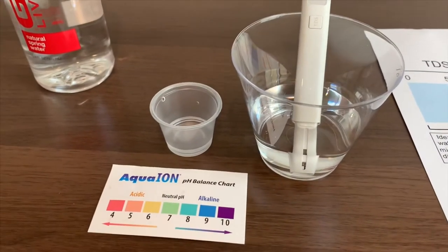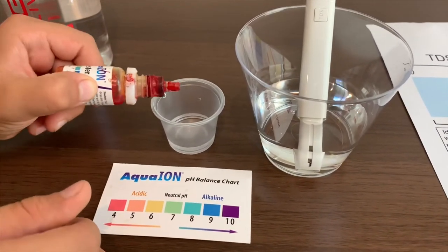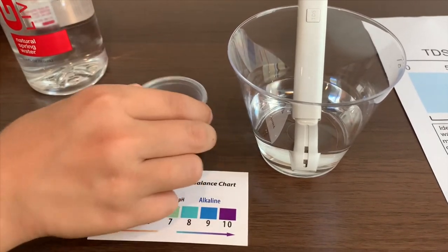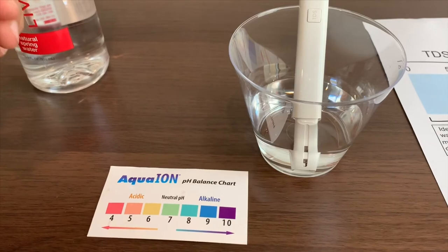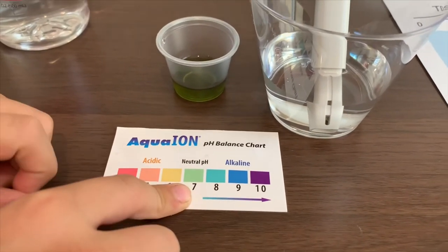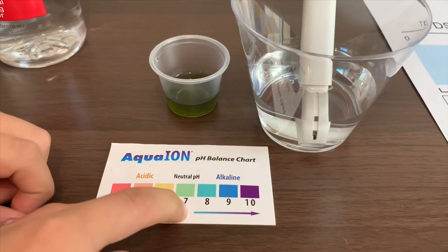Now let's test the pH. Only do two drops. It is green, so it is a 7. That is neutral pH.